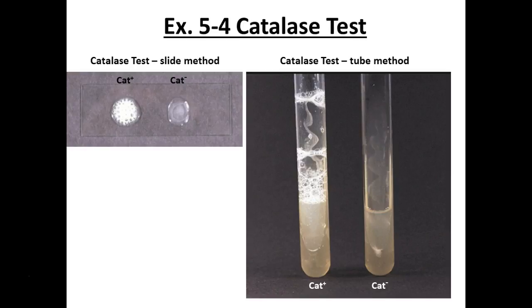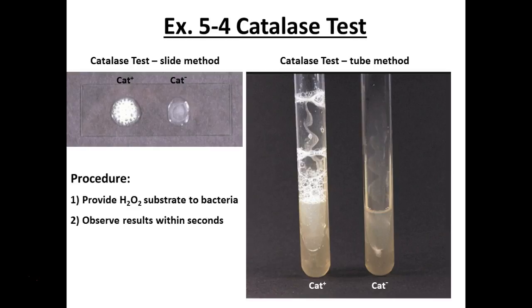I'm going to do a control, a known positive, and I'm also going to do the uninoculated control. And this will happen within seconds, right? You'll see those oxygen bubbles forming.